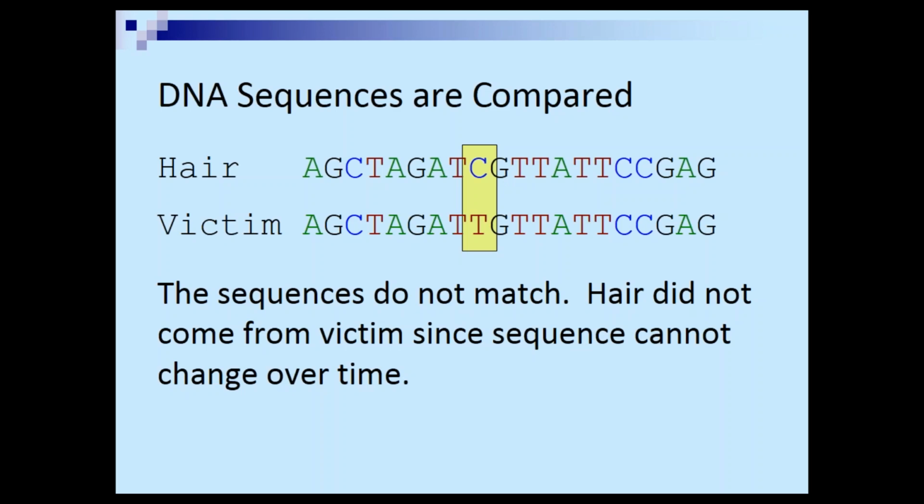The conclusion, as it says up there, you can say definitely no. Just like if the STRs don't match, you can say definitely no. Sometimes people don't want to, if I phrase this as 899 of the letters match, but only one letter does not match, what is your conclusion? The conclusion is still definitely no. Don't let those other 899 influence you. It has to be exactly the same for it to be a match.